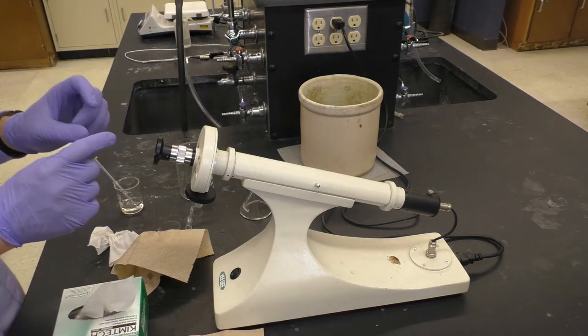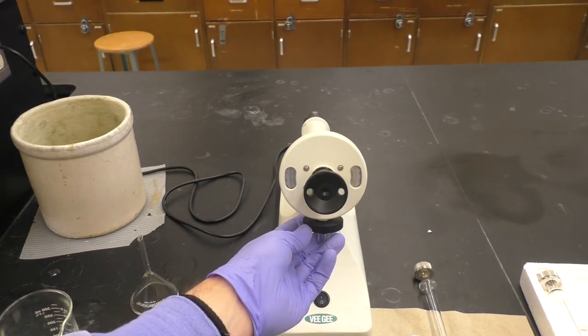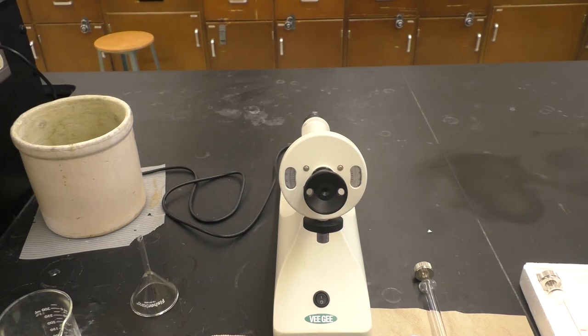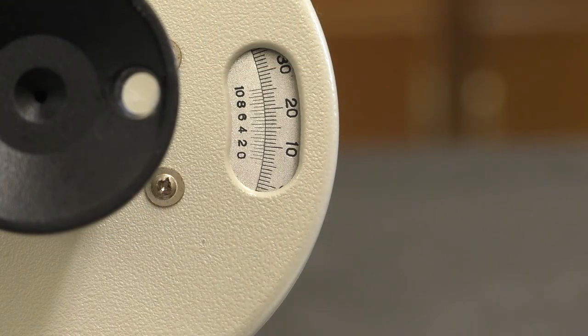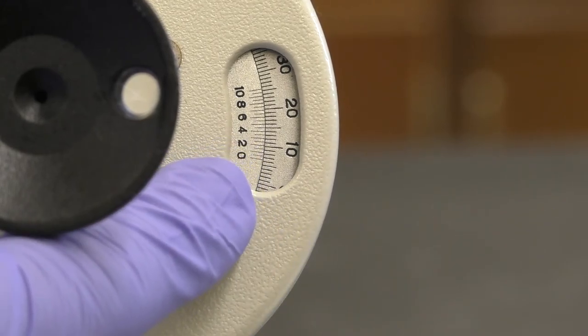Now, unlike most polarimeters that want you to place your sample in and then change the rotation using this bottom knob here to maximize the light through the solution, this particular polarimeter has been set so that you calibrate it and take the measurements by adjusting the knob to make the disk be entirely dark.